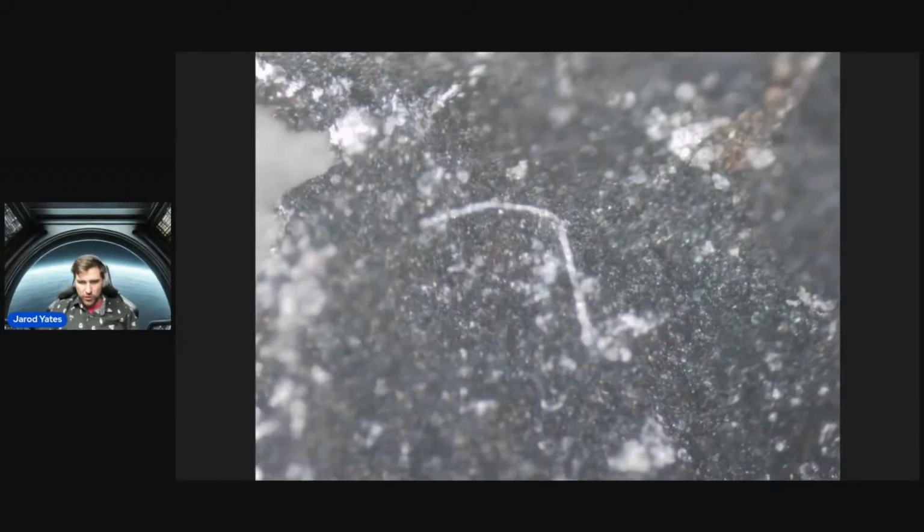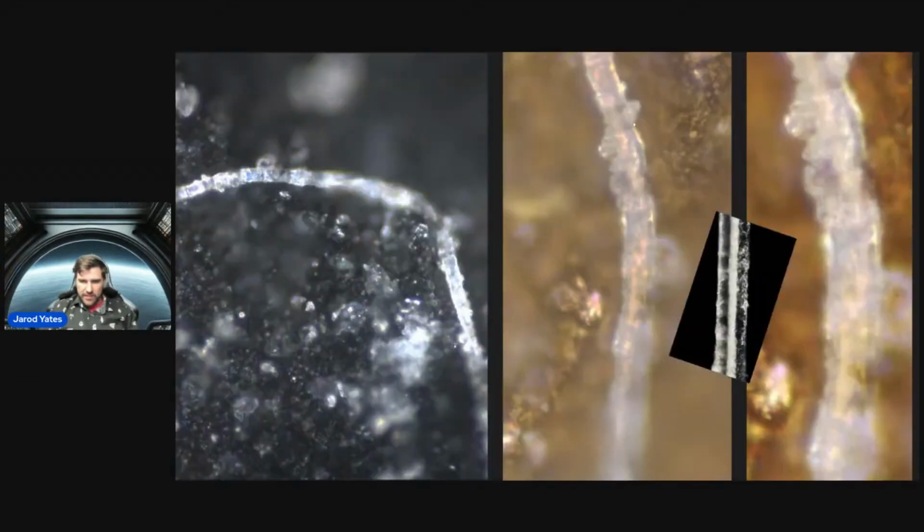Here it is under the metallurgical microscope. This is at like real colors, so you can get a closer idea of what we're looking at. Here is with some added filters to the metallurgical microscope, and you can see it looks like it has some core material going on in there. Well, I found this picture of white or gray hair under a similar microscope, and based upon these little bumps that you see here on the edges, I'm wondering if some old scientist that tested this might have gotten one of their whiskers on there.